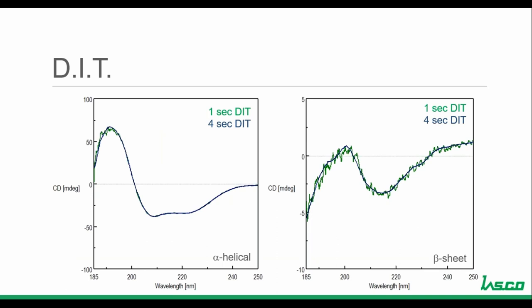Here's an example of how the DIT affects signal to noise. On the left is an alpha helical protein, and on the right is a beta sheet protein, with DIT increased for both. The alpha helical protein shows that increasing the DIT doesn't make a huge difference in signal to noise because it has such a large signal — the only significant difference is at shorter wavelengths below 190 nm where there's already less light throughput. However, for the beta sheet protein, as the DIT is increased from 1 second to 4 seconds, there's a significant increase in signal to noise — partly because the signal is already extremely low for this beta sheet protein.